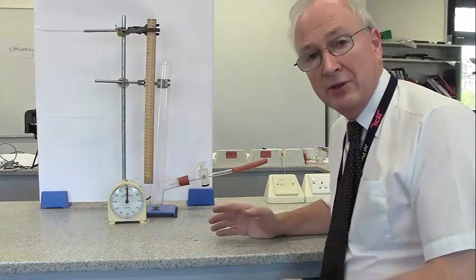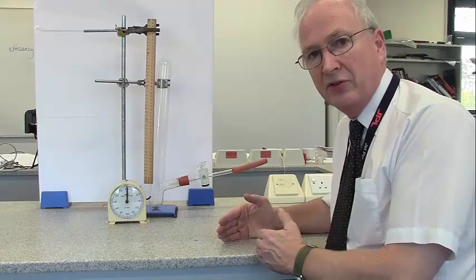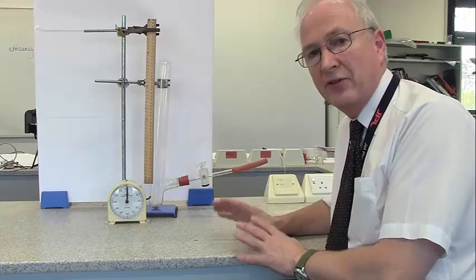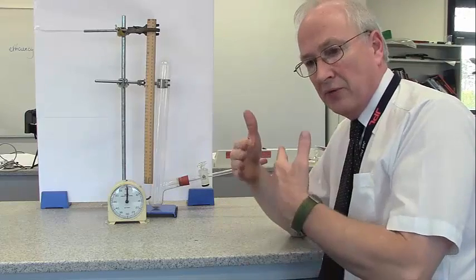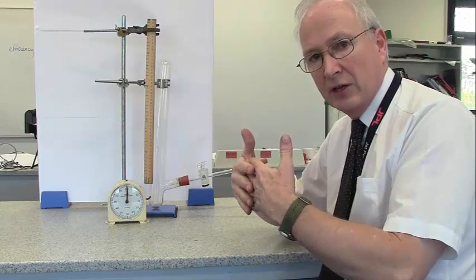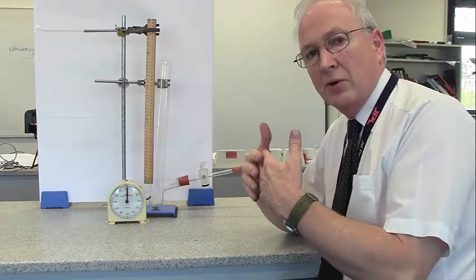This is an experiment on bromine diffusion, and we're going to see how fast bromine gas diffuses through air. The bromine molecules are moving very fast, and so are the air molecules. So if you have bromine and air joining each other, there should be some mixing going on. It might be slow, and it might be fast - we're not quite sure.